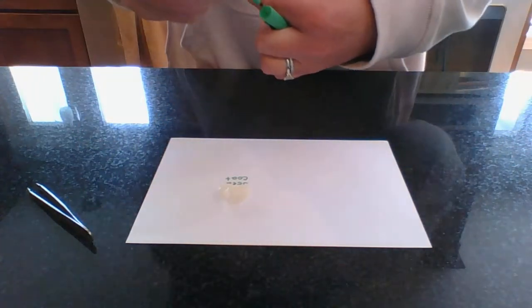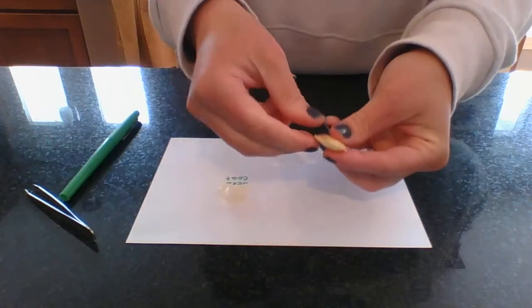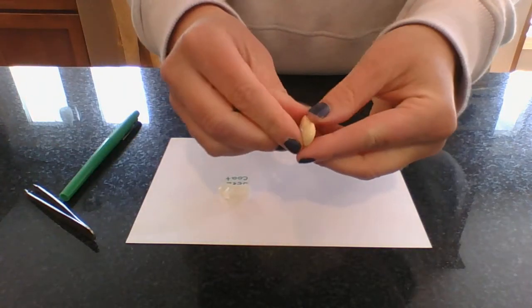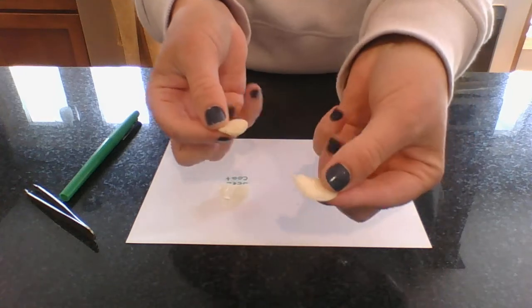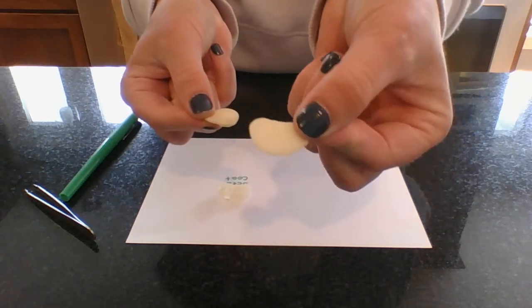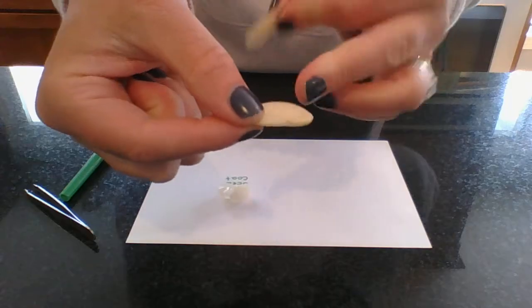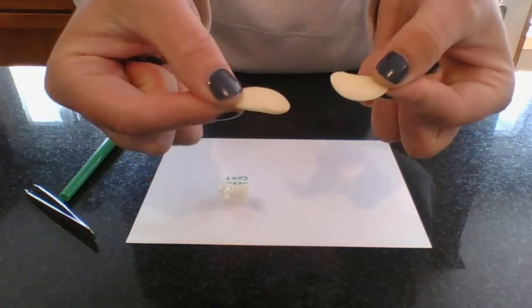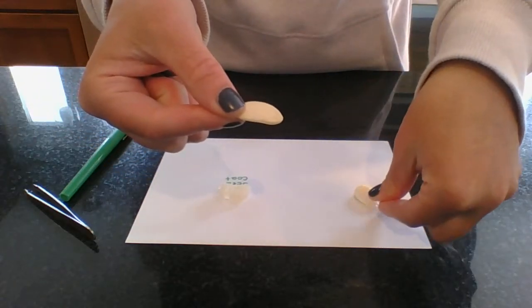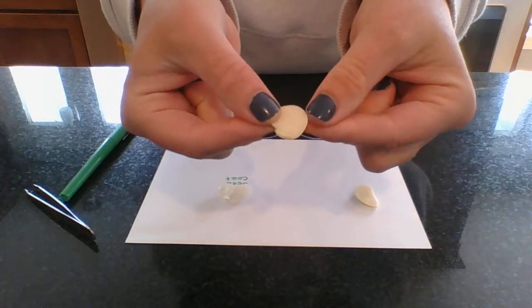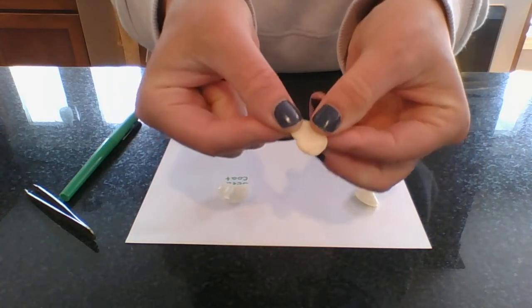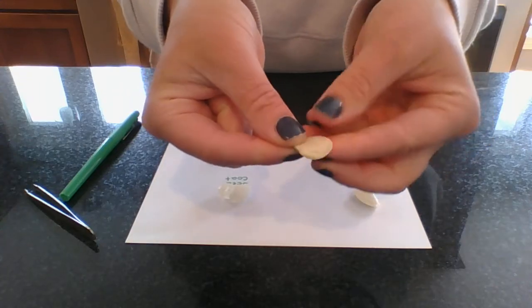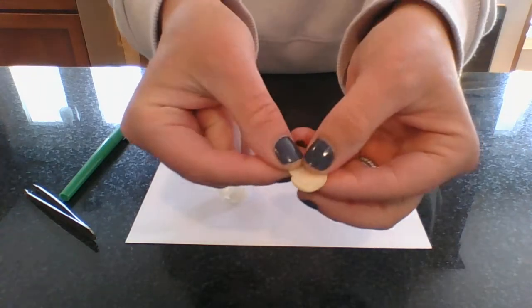Then you open up this part right here. It usually comes right apart. This right here and all around here is the food. It's the seed's food store so that it can grow and get nutrients while it's still in seed form. And right when you plant it, it has some nutrients to grow off of.